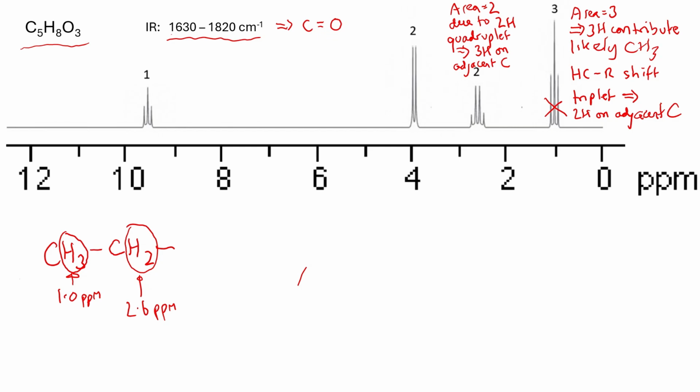So we actually know that we now have this structure, and again each carbon must have 4 bonds, so we know there's a bond to something else sticking out on the other side of that carbon. So that's a really big leap forward, because we've now got a substantial chunk of structure from looking at these 2 peaks. Make sure we finish documenting it.